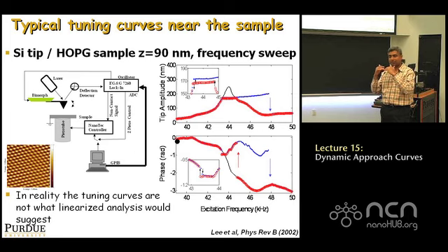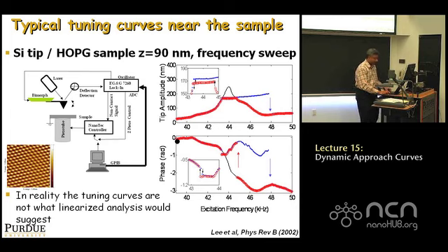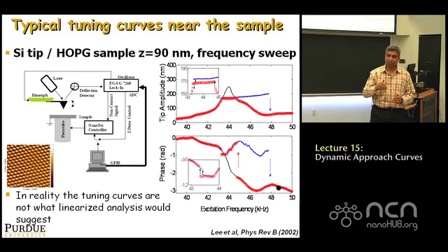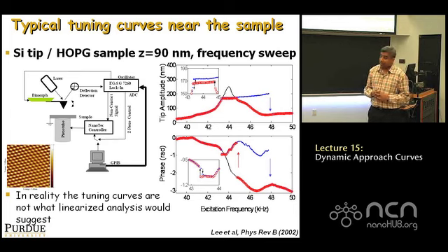And the second thing you notice is as you sweep up, you get a very different response as when you sweep down. And this is where the nonlinear nature of this really comes in. And you actually see it very nicely in the phase. When you look at the phase, what happens is at the same points where the amplitudes jump up and down when you sweep up and down, the phase also jumps up and down. This is what happens.